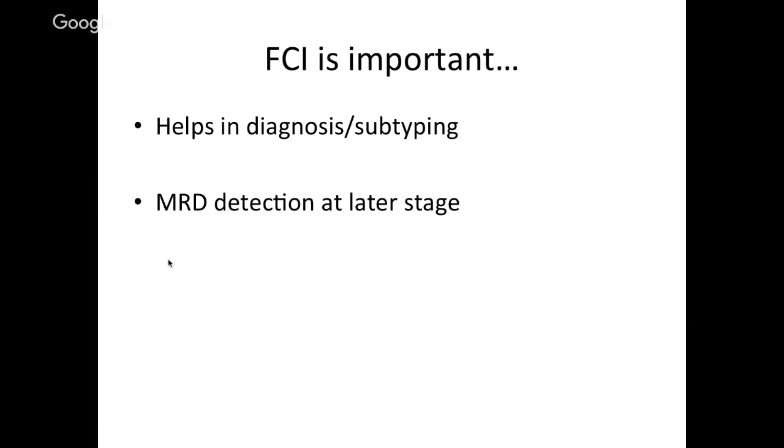One, it helps you in subtyping. More important, it helps you at the later stage in MRD detection, because you need to have upfront markers, in this case of leukemia. It always helps to have a diagnosis upfront.